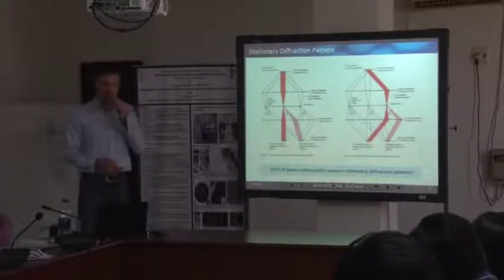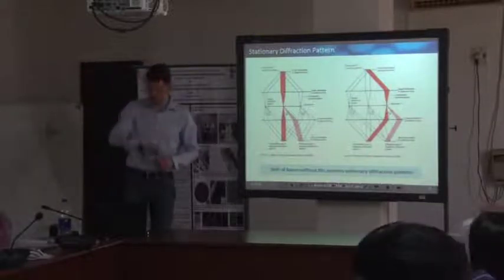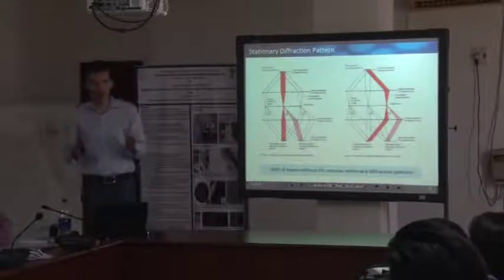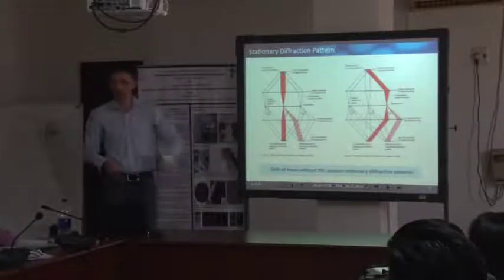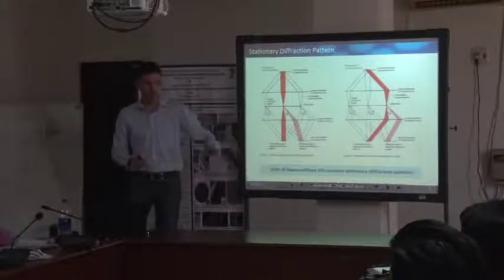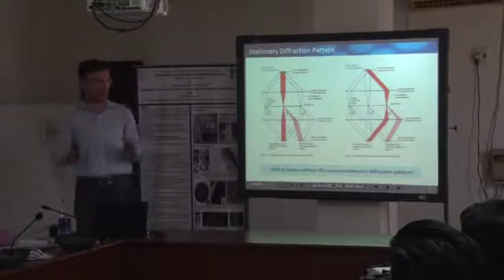This is the difference in scanning. In the scanning electron microscope, we just deflect the beam, you know. And for large fields of view, the local angle of impact on the surface changes. I mean, we just raster scan this beam, and only in the very center of our image do we have a perpendicular impact on the surface, and as we go further, let's say we have a scan field of 1 millimeter, this angle is already pretty large.